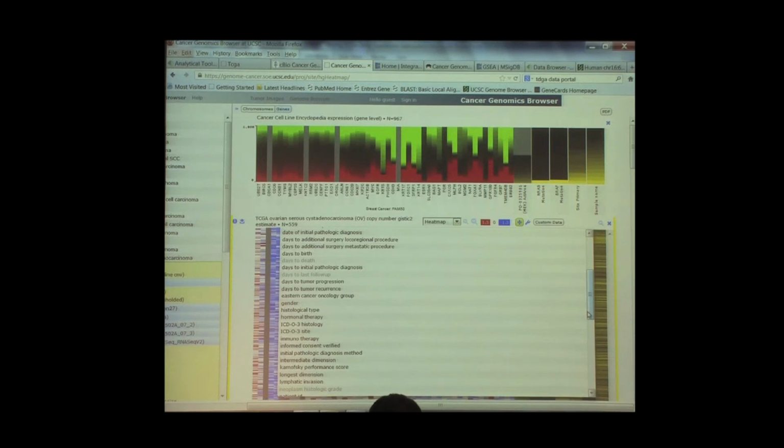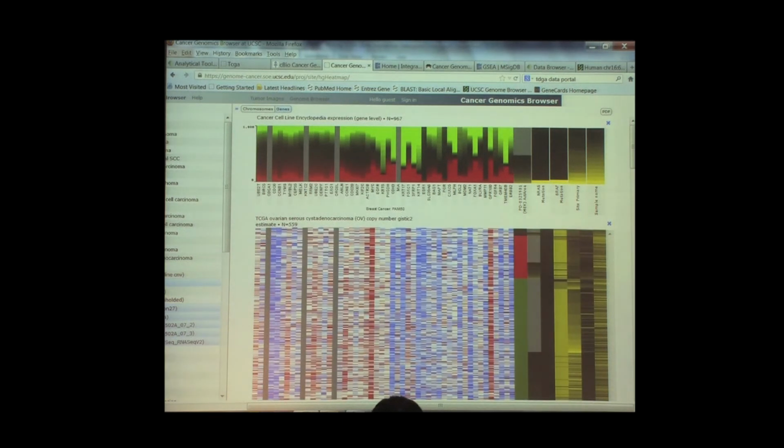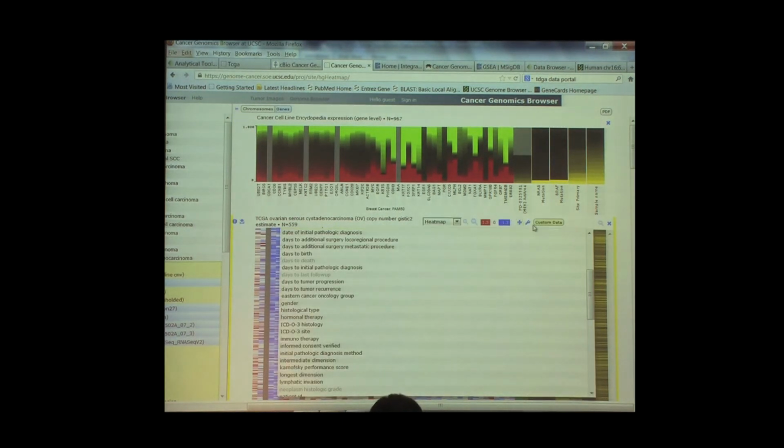And in this tool, if you subset on both early survival and days to death, we can then start to see. Days to death for me is already clicked. Yeah, I already selected it. I'm like, why is it grayed out?